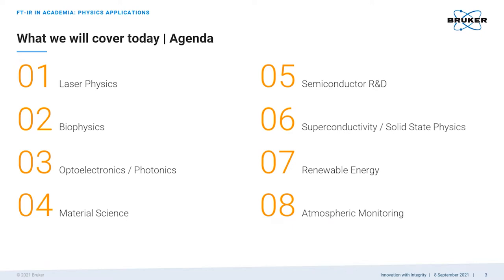We start with applications in laser physics and then go from biophysics to optoelectronics and semiconductor physics. We'll show you that FTIR is a powerful tool to characterize and reveal optical properties of almost any material or device. But let me reassure you, even if your area of expertise is not featured here and you don't see yourself working in the fields above, this webinar is for you. I promise that if you're working in physics, our webinar will cover topics and techniques that are of interest to you or at least might inspire some new ideas.